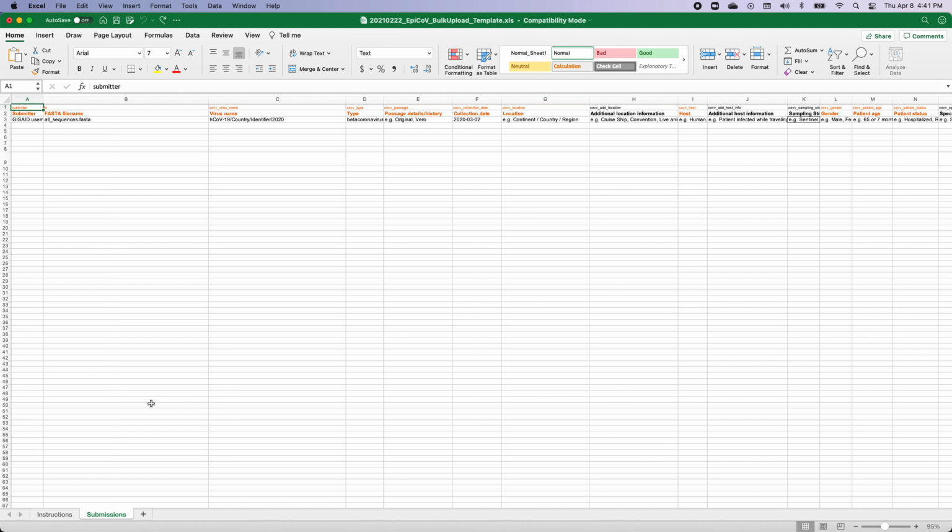Intuitively, you may think you could just download and open up the workflow output and then copy and paste it into this sheet. But because Excel is Excel, it will auto reformat your dates and mess with the entire upload process if you just open up the sheet as is. So let me show you my little workaround to this whole thing.